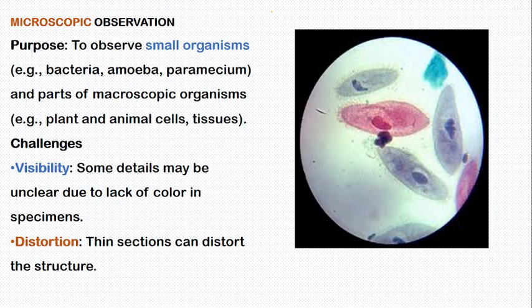This is the microscope, which is here, okay? This person is now observing. In his eyes, this is what he or she is looking at. Means they see things like this, okay? Means in his tools or any sample you put, if there is any organism, you're going to look at it like this.